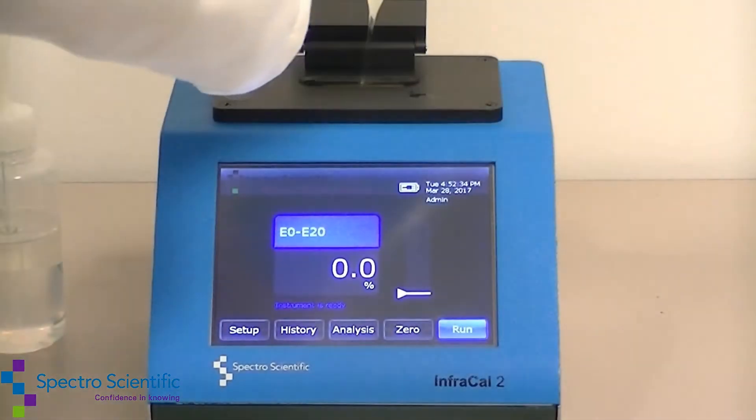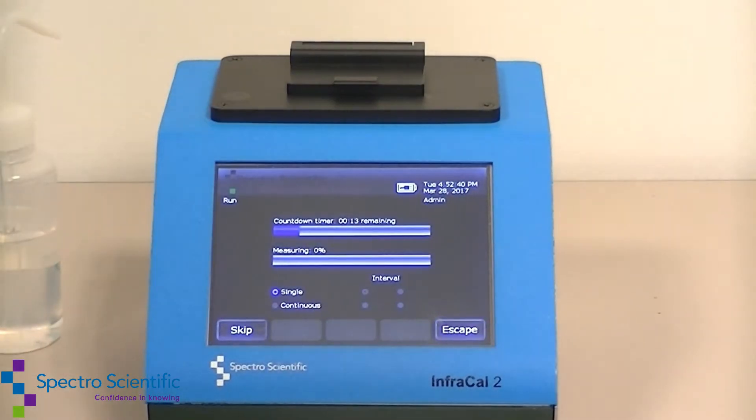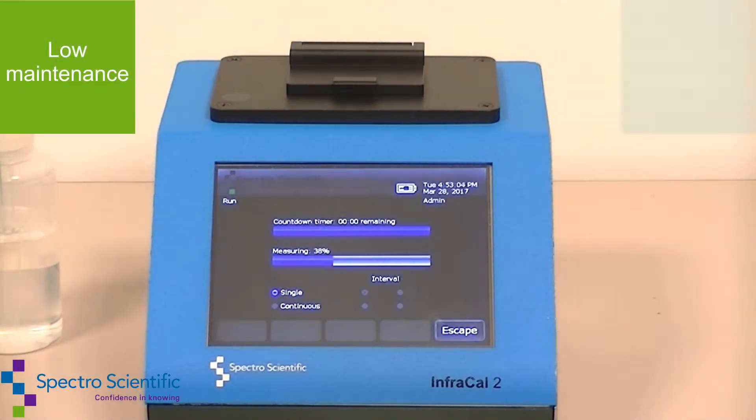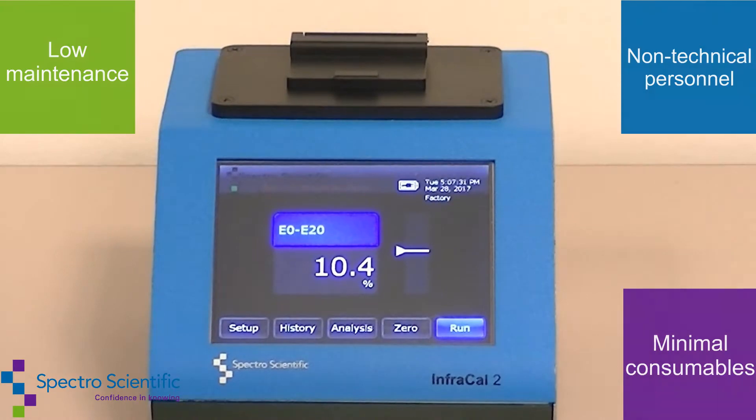The InfraCal 2 will help speed up productivity and save time and money by providing results in under a minute. This low-maintenance instrument was developed for use by non-technical personnel, is low-cost, and requires minimal consumables.